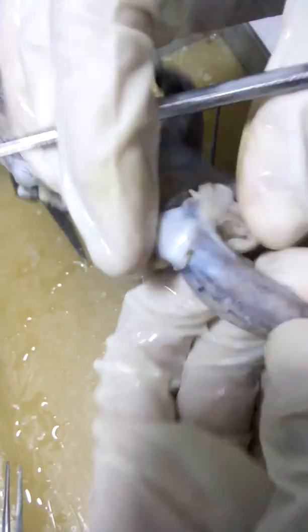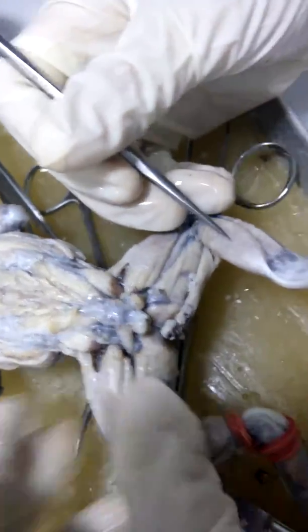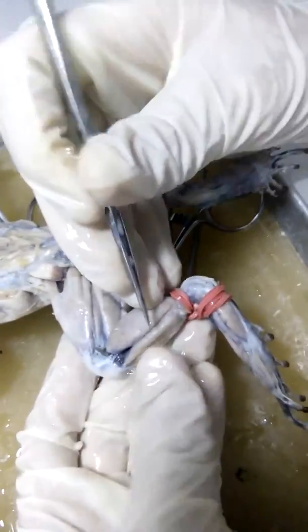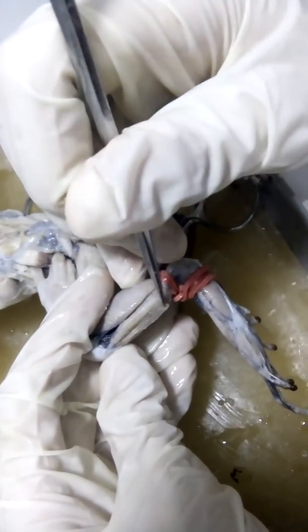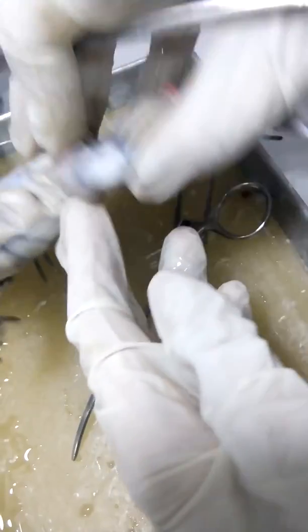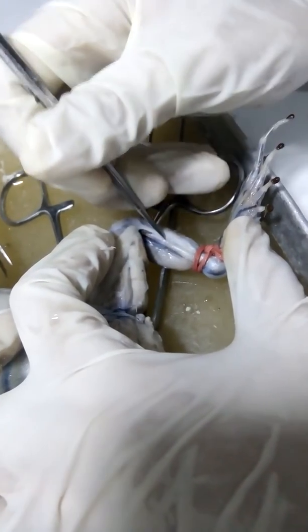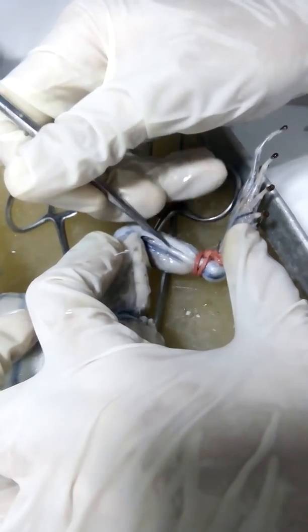So proceeding to your shaft. This dorsal portion, makita nato very visible the gastrocnemius. Lateral to it would be your peroneus. And then we can see here your tibialis anticus, part of your tibialis anticus longus. Going to the ventral portion, we can still see your gastrocnemius. Lateral to it, this one right here, is your tibialis posticus.